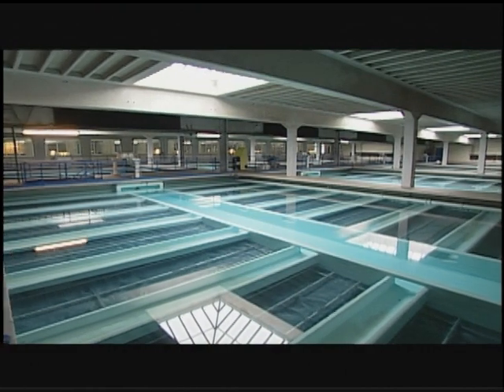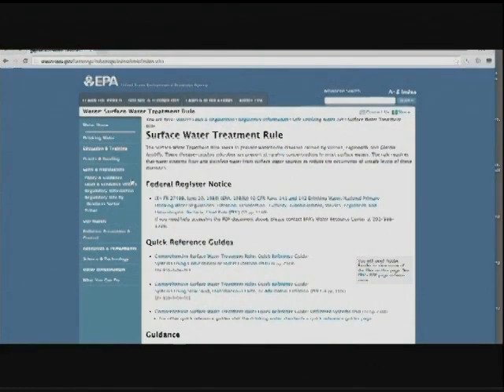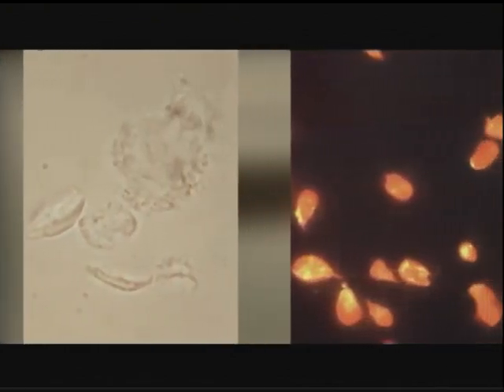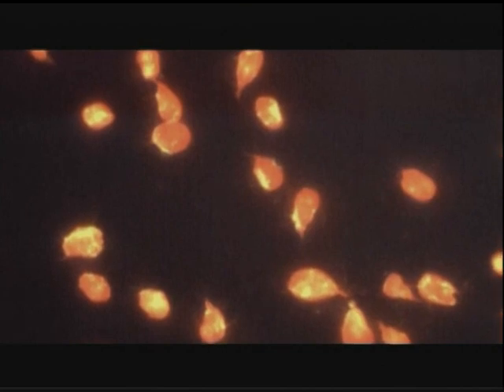There is lots of research demonstrating that turbidity removal is a good surrogate for Giardia removal in a conventional filtration process. In fact, that is the underlying basis for the treatment technique requirements of the surface water treatment rule. Research has shown Giardia-sized particles may pass through the treatment process with no increase in filtered water turbidity readings. That's because small concentrations of micron-sized particles scatter very little light. Here, a closer examination of the particles is necessary.